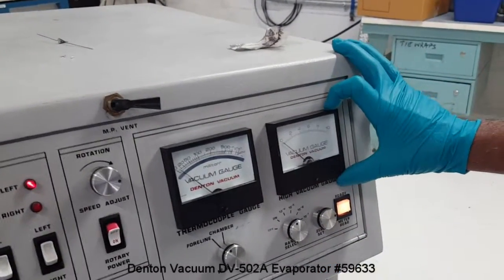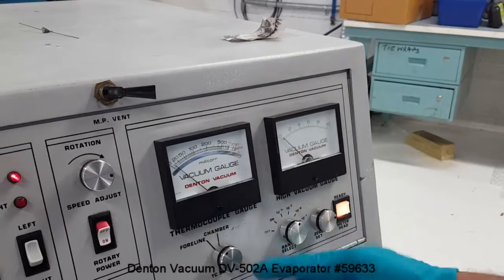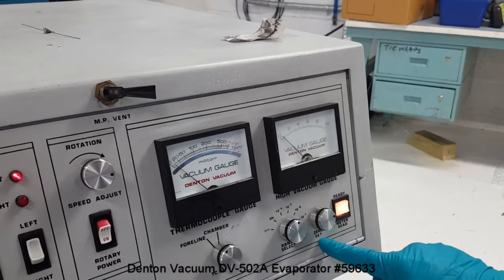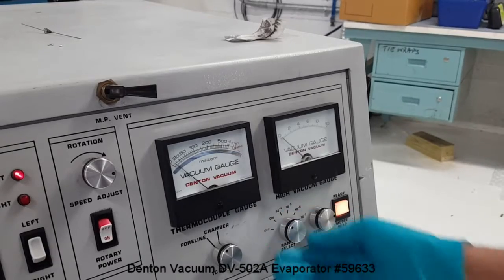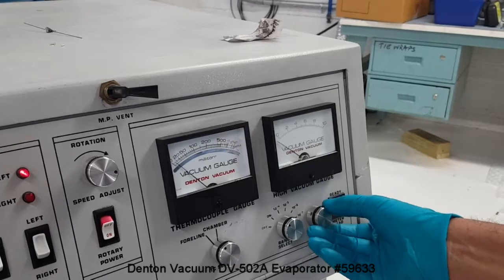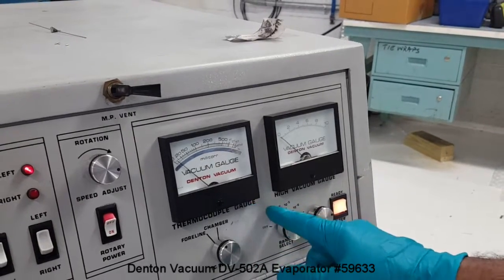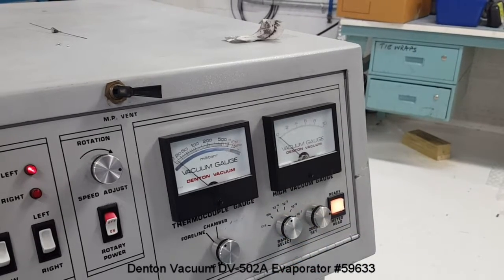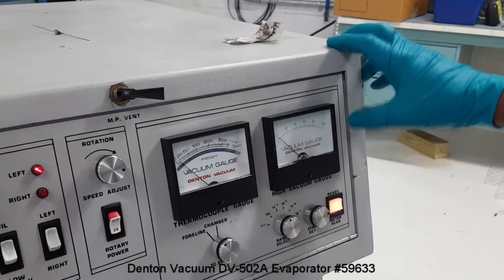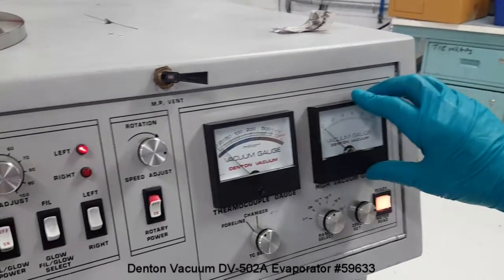There is a cold cathode sensor in the system. Using the set knob here, the zero level can be adjusted. Usually when it is on, you adjust the zero. Once it is adjusted, you can toggle it from the 10 to the minus 4 Torr range to the 10 to the minus 7 Torr range. At any point, if the chamber vacuum goes into the 10 to the minus 3 Torr range, the sensor will be turned off automatically.